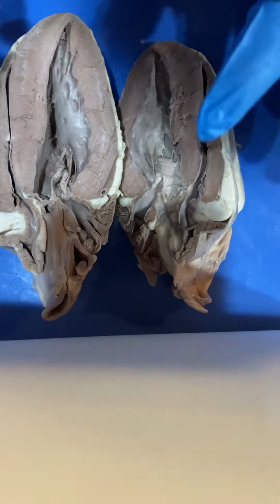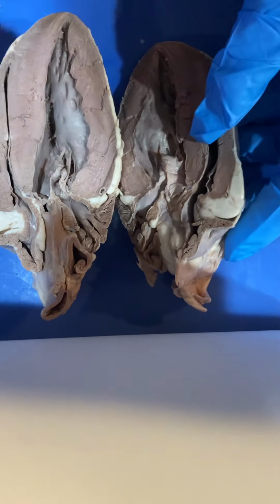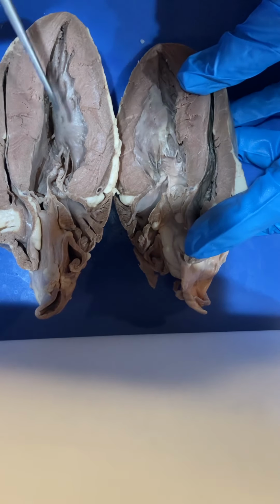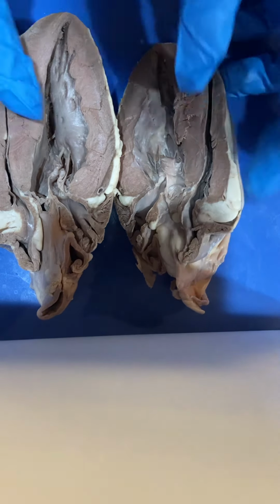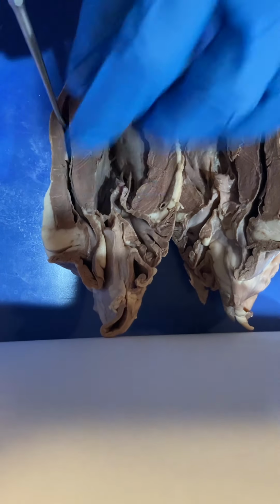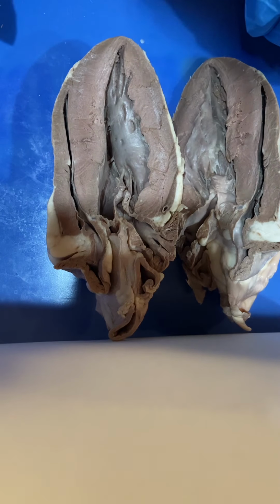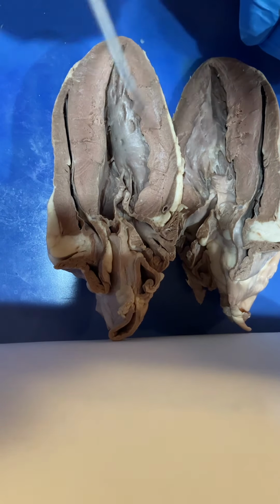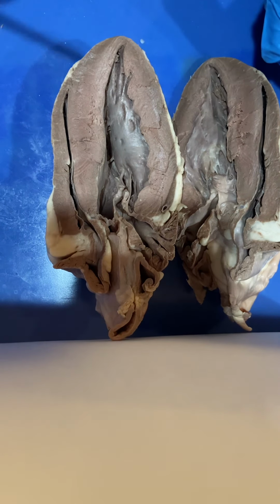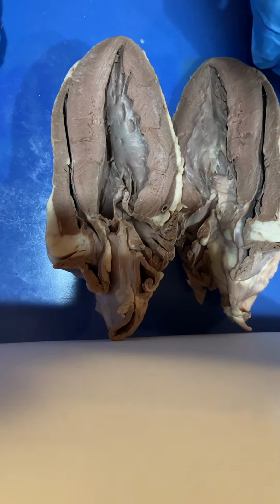So as I cut it, you'll notice that the left and right ventricle are on both sides. And one thing that's going to stand out that is very major is that the left ventricle is going to have thicker walls. So as you see here, these walls are going to be way thicker than on the right ventricle. Now this is because the left ventricle is actually going to be pumping blood to the entire body, where the right ventricle is just going to be pumping it to the lungs, so it doesn't have as far of a distance to pump, and therefore it doesn't need as thick a muscle.